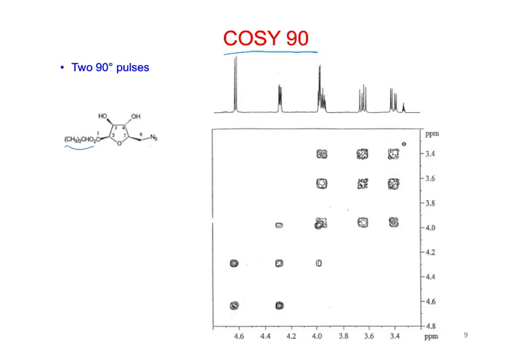All right, so which of the protons in here do you think would be most characteristic, and which one could we assign to one of these peaks along the diagonal? Number 6.